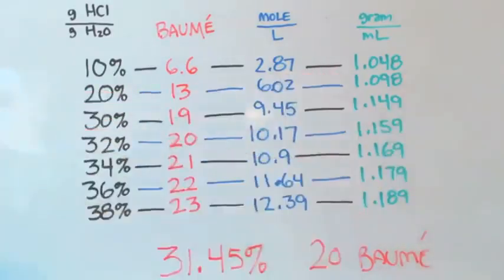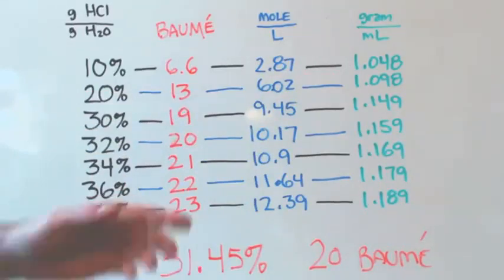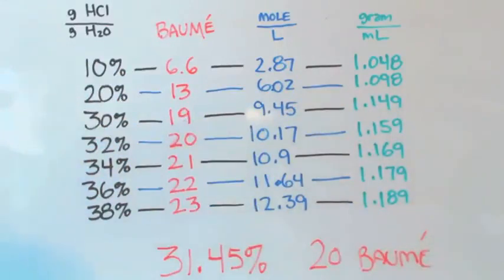And here are your densities. Oh, that's what I wanted to say: since it's a 10, that means there's 10 moles in every liter. That means every 100 milliliters has 1 mole. So it's easy to figure anything out. You need 2 moles of something, 200 milliliters. You need 75% of a mole, that's 75 milliliters. You need 3.5 moles, that's 350 milliliters. Okay? It's nice, easy math. You can do it in your head.